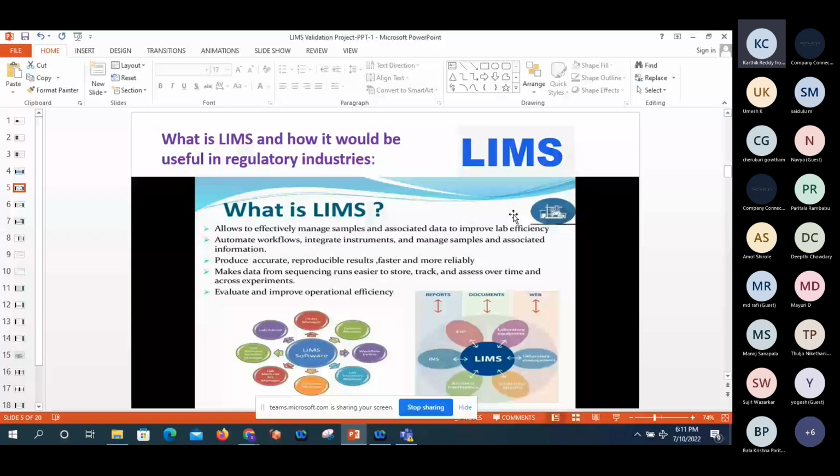We are completely paperless, and whatever is available on paper we will enter as the master data in LIMS. Master data plays a very important key role in LIMS. Why? Because whatever data is currently available in the specifications, standard testing procedures and protocols, which are currently paper based, we need to enter in the LIMS management tables. There are a table manager and explore tables available in LIMS. There are huge numbers of tables, nearly 200 to 300 for each vendor, like Labware LIMS.